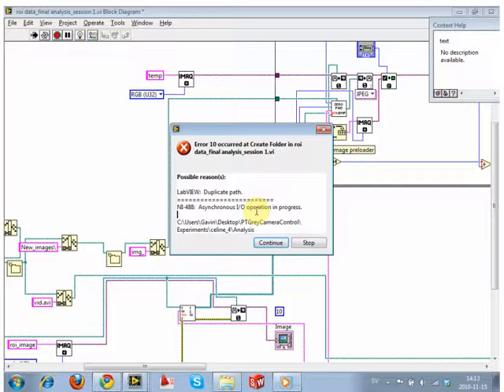We're doing a lot of things in here, and you should always have your data backed up anyway, but we don't want to be running an analysis while we're actually deleting our data at the same time. We want to protect our data, and this is one way of doing it. These things are set never to destroy your data. So right now we just hit stop.